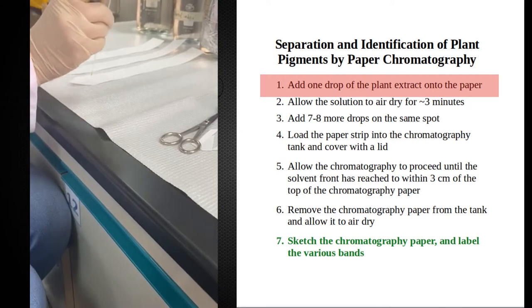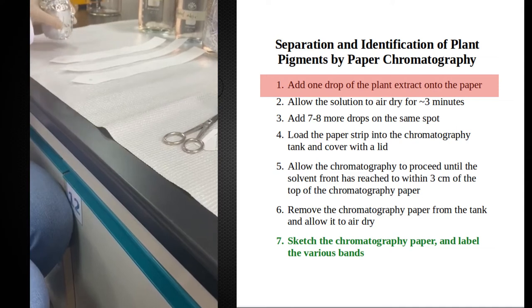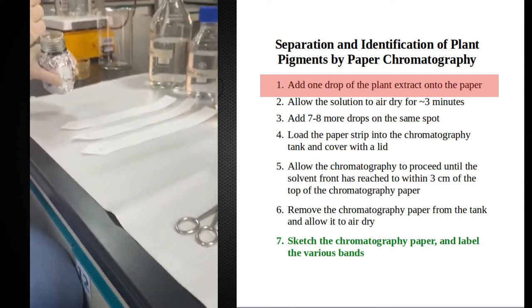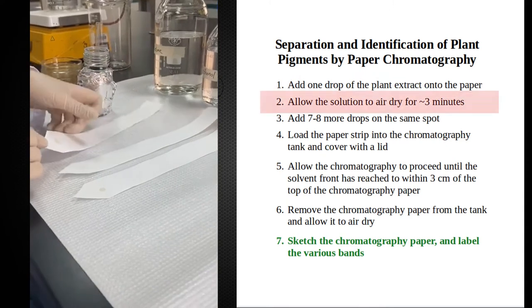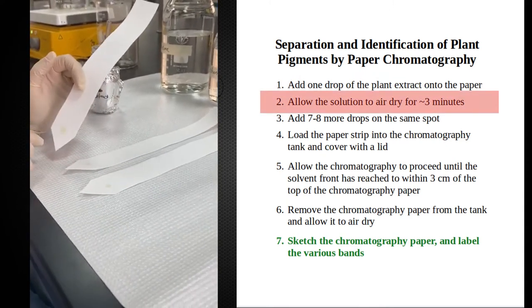I'm using more than one paper because I want as much of the separated components as possible. What I am doing in this experiment is putting drops of this chlorophyll extract onto paper made of cellulose.